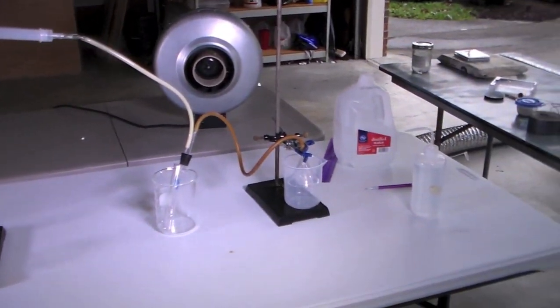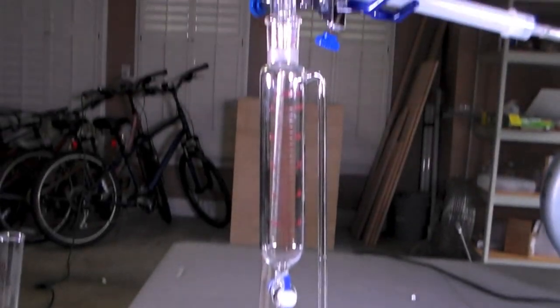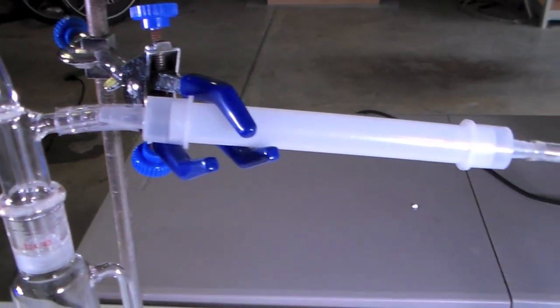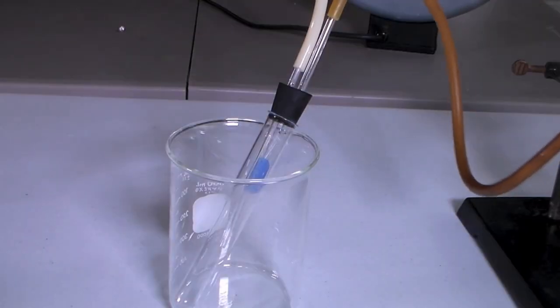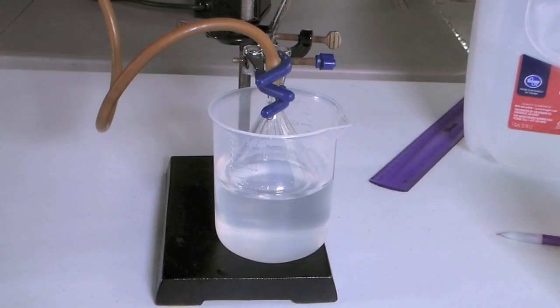This is my setup to generate liquid chlorine. I have a chlorine generator, followed by a drying tube containing calcium chloride, a test tube to condense the dry chlorine, and then a sodium hydroxide trap. The sodium hydroxide will neutralize the chlorine so that it doesn't enter the atmosphere. The funnel in the trap serves to prevent suck back.